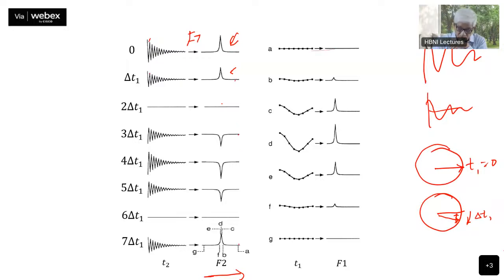You plot the values at the points in the spectra at value A, at this point, this point, this point, like this, all of them, you plot them here. So this generates a time variable here, because what is varying here? This is T1, right? That's what is written down here. So as a function of T1, this is how point A is varying. Come to B, you see there is a small dip. Here it is 0. At this point, there is a dip. You took the various points here, B, like this. There is a small dip here, which gives you a small signal of this type.